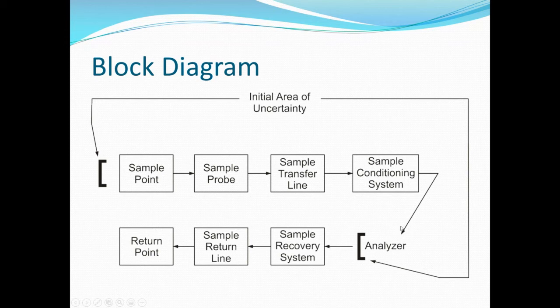I'm standing at the analyzer. Let's crack a nut on the tubing and see if we get flow. And if we have flow here, then we can assume that it's something beyond. If we don't have flow here, then we're going to go back to the other side. We're going to crack a nut here and see if we've got flow here.